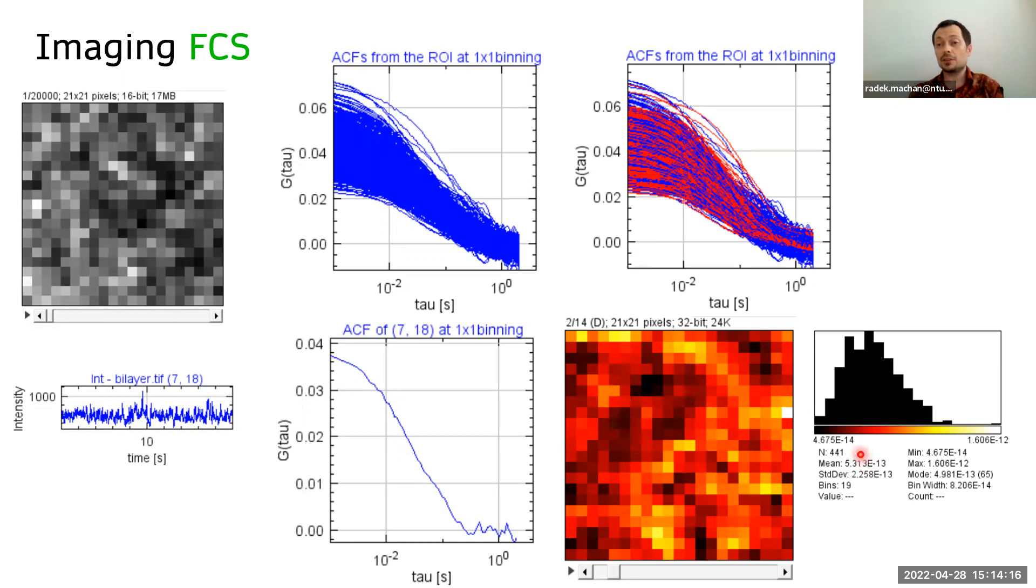such as diffusion coefficient and its distribution. And this is all done in our imaging FCS plugin, which Thorsten started developing nearly 10 years ago. And you can install it through imaging FCS update site in Fiji.